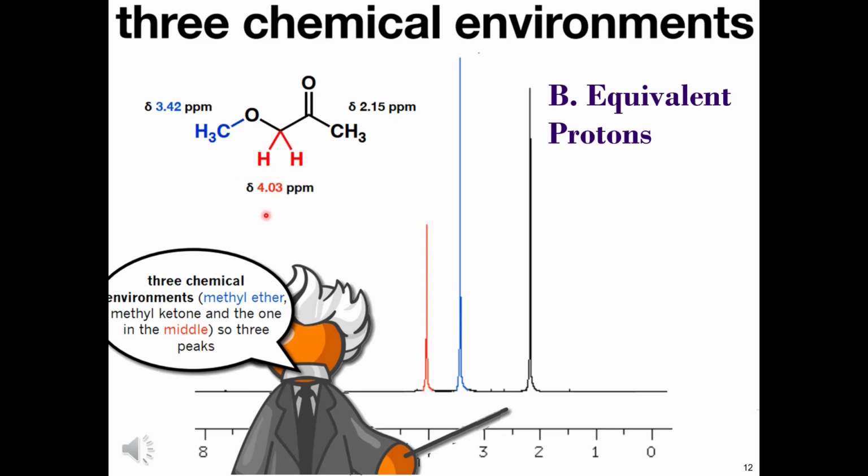This is for the methylene group in the middle of the molecule. It's a CH2 group. This methylene group is neighbouring two electron withdrawing groups. That's the carbonyl group and the electronegative oxygen atom. Earlier, we said that these electron withdrawing effects are additive, and here is the evidence of that. A proton environment that is bridged between two electron withdrawing groups, producing a signal that is the most deshielded.